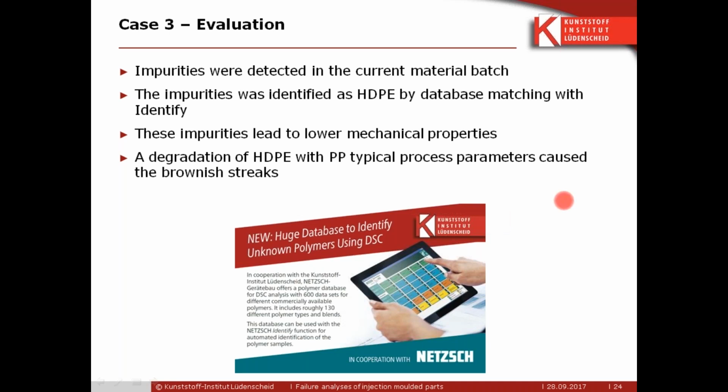So, with regard to failure analysis, we saw some really different causes. The first one was a material question. The second, with the PVC, if I think back, was due to processing, and the third one was again a material thing. But I would have all these different parts. Are there any general recommendations from you on how to prepare the sample? Or I mean, it depends on the method.